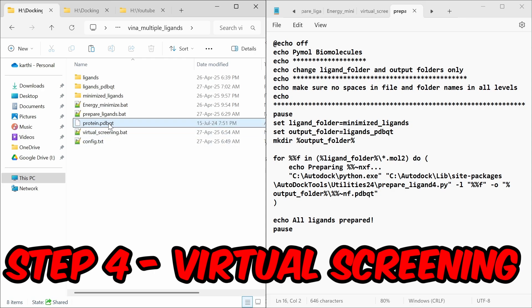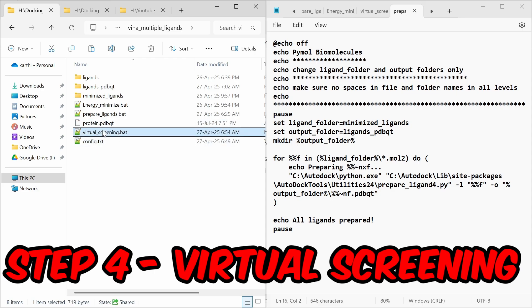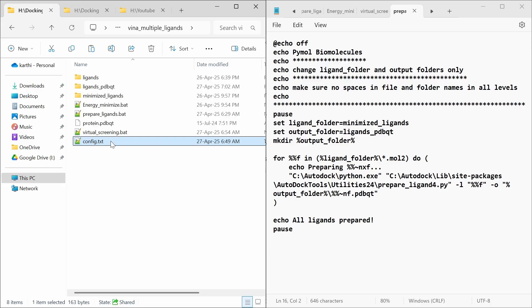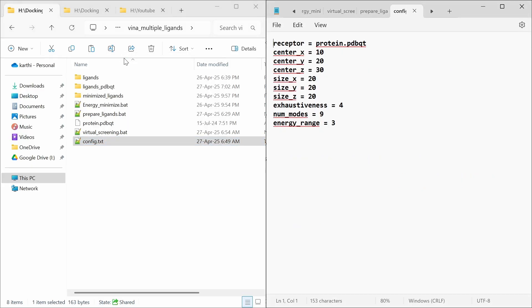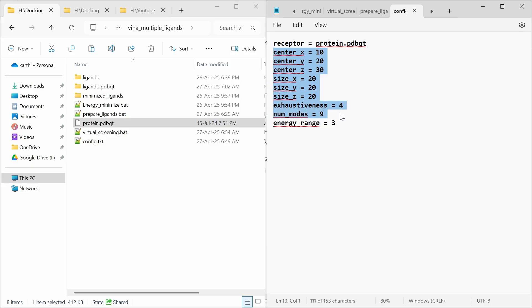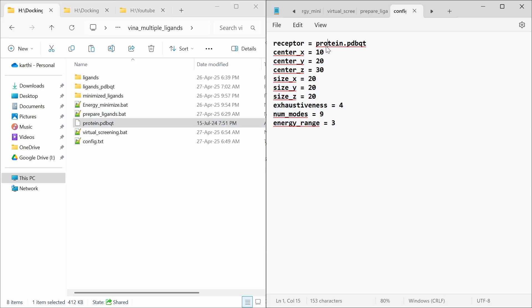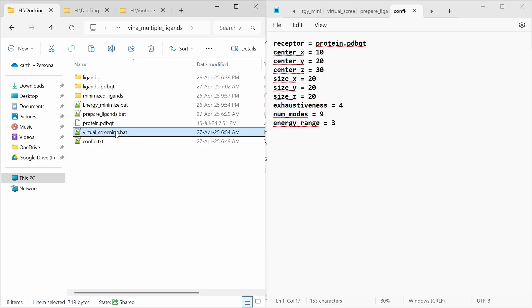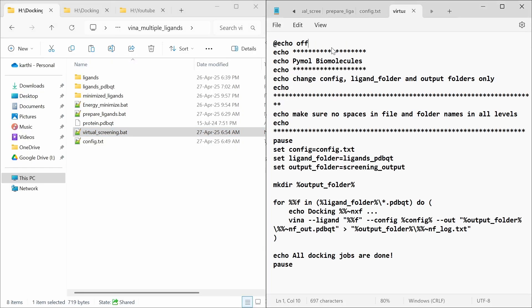Step 4 is virtual screening. For virtual screening you have to place the protein pdbqt and the config.txt file. In the config.txt file you have to specify receptor, center, size, exhaustiveness, modes, and energy range. These are not the exact values — I have used these values for demo purposes. You have to use your exact values. I have used protein.pdbqt, so I am giving the same name in the config file.